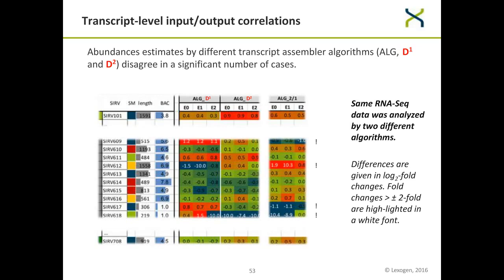And the evaluator actually calculates the accuracies for all individual transcripts as log 2-fold change of the expected to the measured abundance. So shown in green are here now log 2-fold changes between -1 and +1. That corresponds to a 2-fold lower or higher concentration. In red, you've got all those values with more than 1 log 2-fold change, and in blue, the ones below -1.